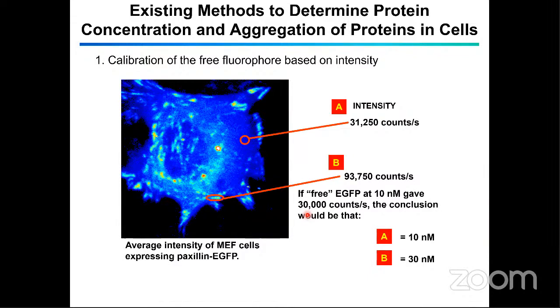However, what this doesn't tell you is whether those molecules are bound together, or whether they just accumulate in this region because they are contained in some larger structure. So we cannot really measure the aggregation state just by looking at the intensity this way.